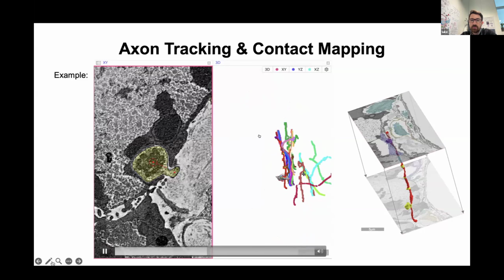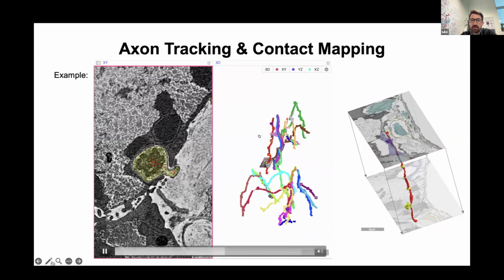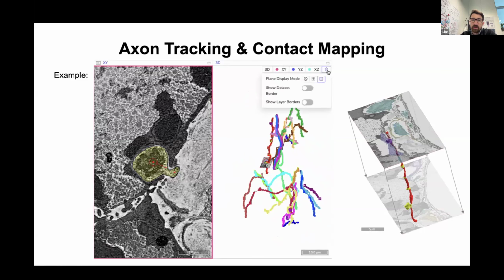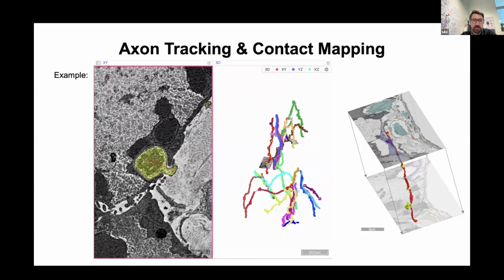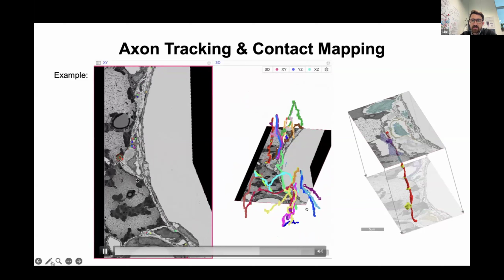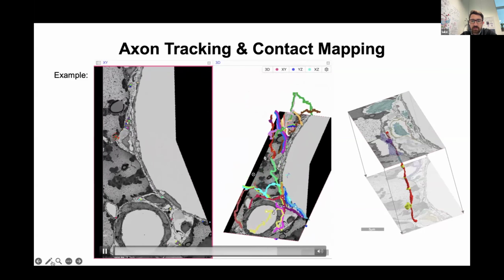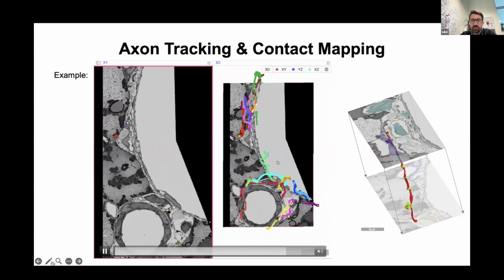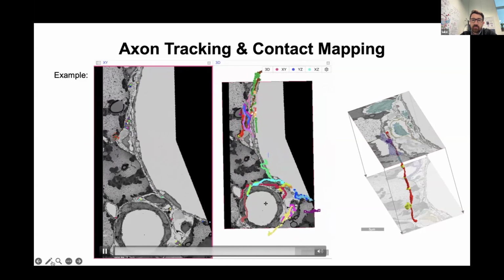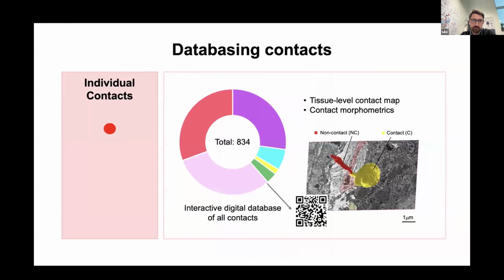And as we zoom out, you begin to get an idea of the complexity of the nerve network around the portal vein. So you can see most of the nerves are around the afferent vasculature. Here is the portal vein, which brings blood from the gut. You have hepatocytes here, a bile duct, and all of these axonal fibers in amongst the connective tissue that we're trying to begin to understand.